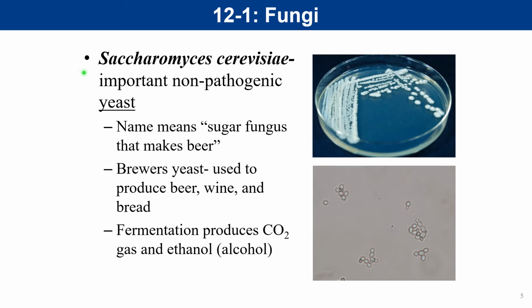Here's a yeast that we'd much rather run into and talk about. As opposed to yeast infections, we can talk about a non-infectious Saccharomyces cerevisiae, also known as the baker's yeast or brewer's yeast. And we can break down its name to understand a little bit more about what it does for us. Saccharomyces is referring to sugar, and myces means yeast or fungus, so it is a sugar-loving fungus. And cerevisiae is in reference to the Spanish word for beer, cervezas. So stay thirsty, my friends. The yeasts are there to make us more beer.